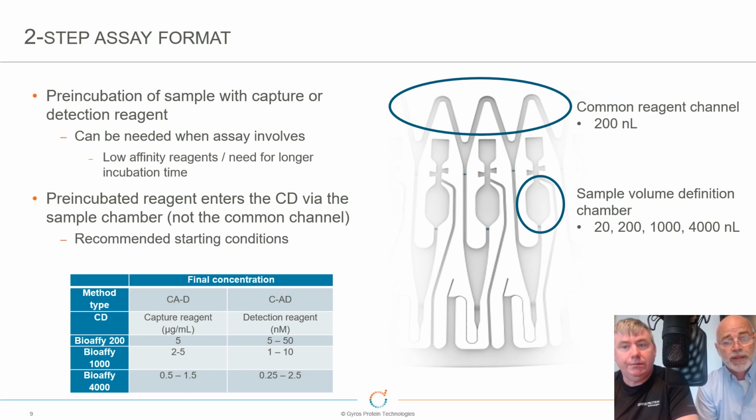And again, you can flip this around and do it in two flavors. You can do capture reagent, analyte incubation. You can also do a detection reagent, analyte incubation.